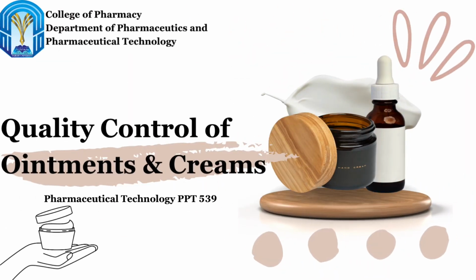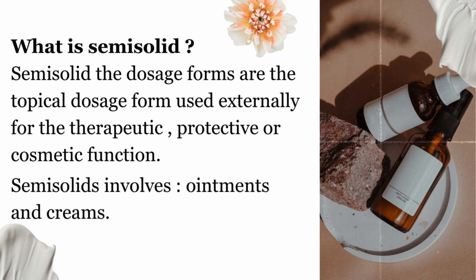Quality control of ointment and creams. What is semi-solid? Semi-solid dosage forms are the topical dosage forms used externally for therapeutic, protective, or cosmetic function. Semi-solid involves ointments and creams.